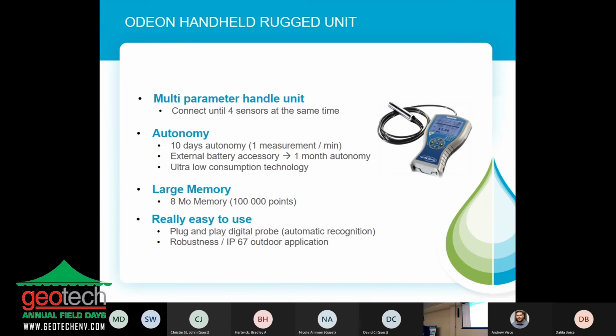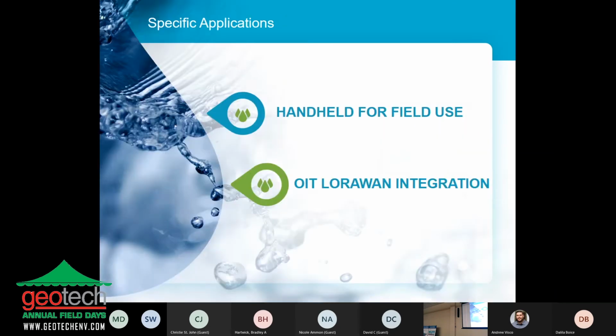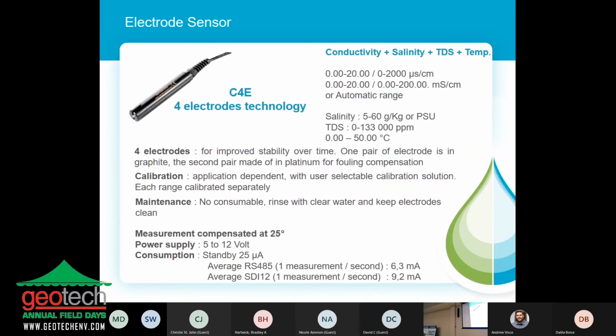Yeah, we have different auto diagnostics that are running permanently inside the sensor. One is: are you in or out of the range? So if, for example, you are using a conductivity sensor in that range and the sample comes out of range, you're going to have this diagnostic and you're going to have the information. You also have another diagnostic of the calibration parameters. If you're out of suitable calibration coefficients, that's a diagnostic. And you have the permanent control of the communication as well. If you have a trouble inside the communication, it's going to be a diagnostic.